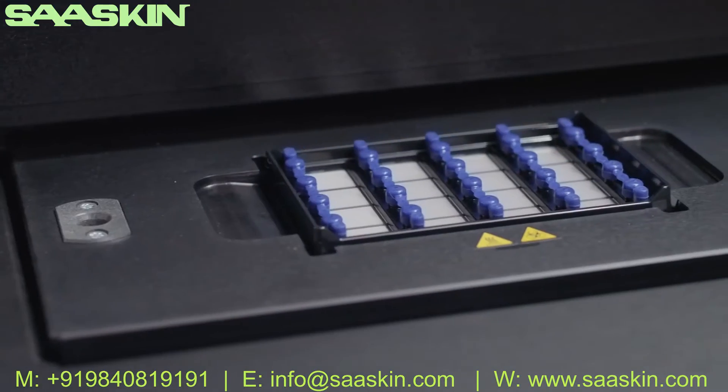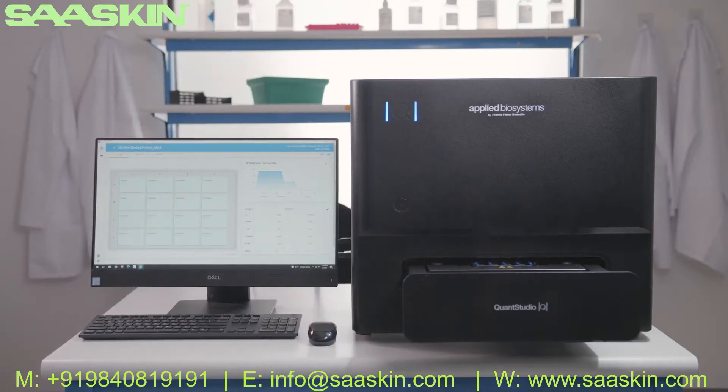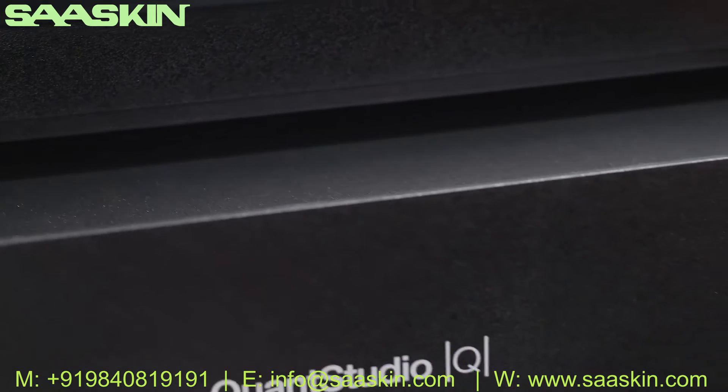After loading your plate, start your run and return in 90 minutes for sensitive, accurate, and precise quantification of your targets.